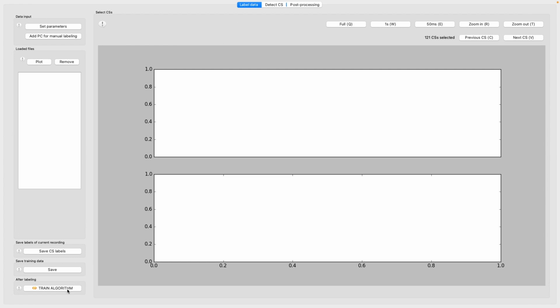Only during the training algorithm, you move a little bit away from this platform to Google Colab, which is a necessary thing to do right now, since we do not have a GPU in our computer, and not everybody will have it all the time. In some cases, you can have it, so that's good. But if not, then anyone can actually just use this software, and it's very interactive.